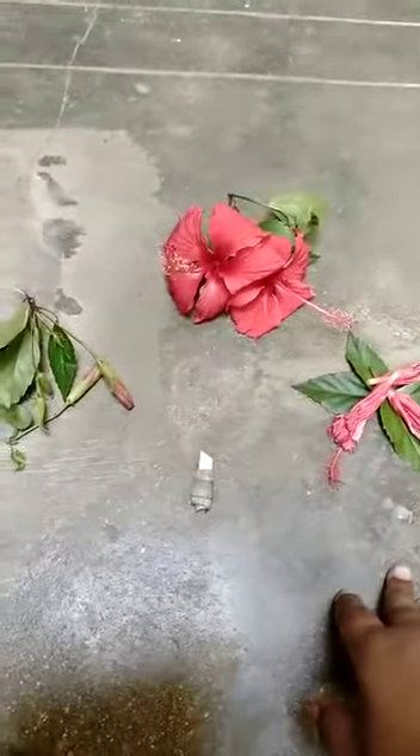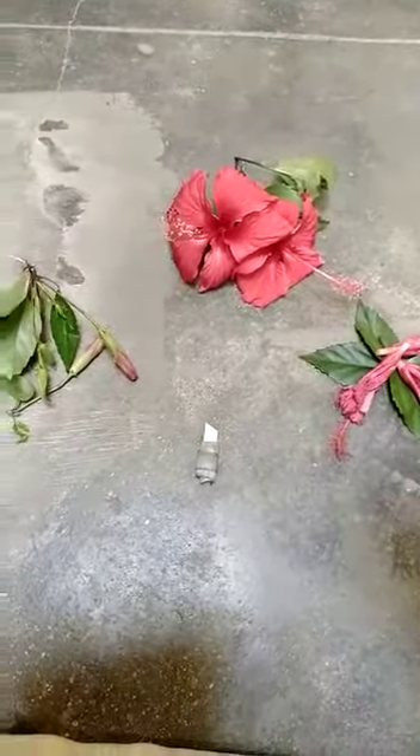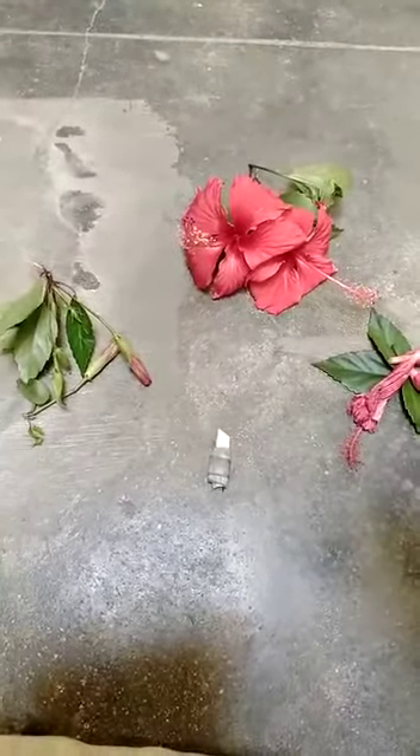Hey guys, good morning everyone. Today we are going to undergo an experiment of how to dissect a hibiscus flower.